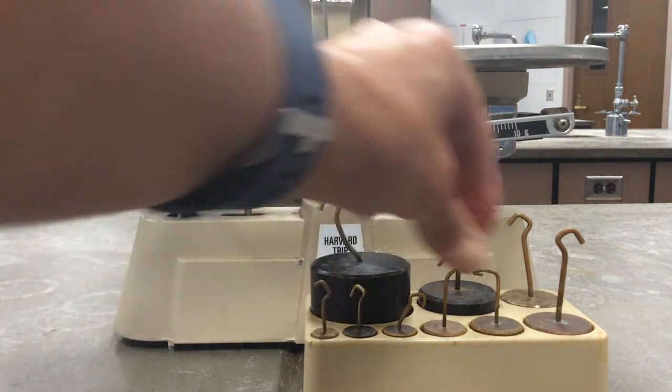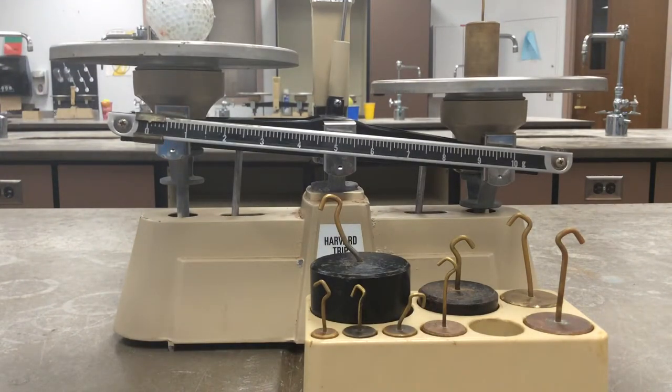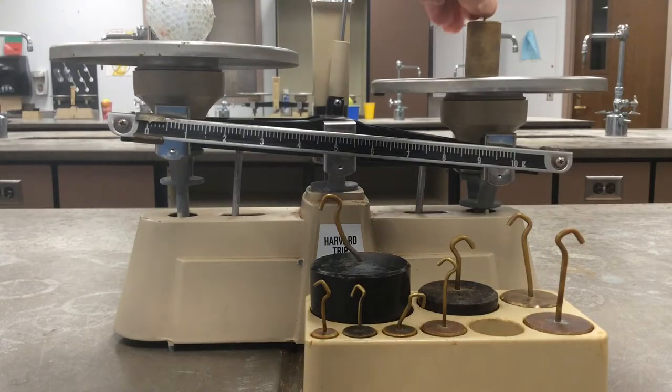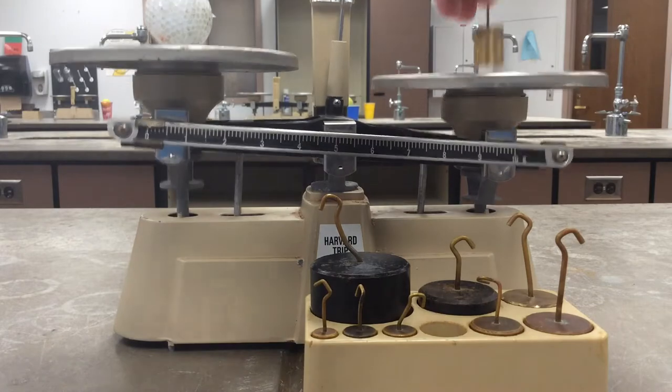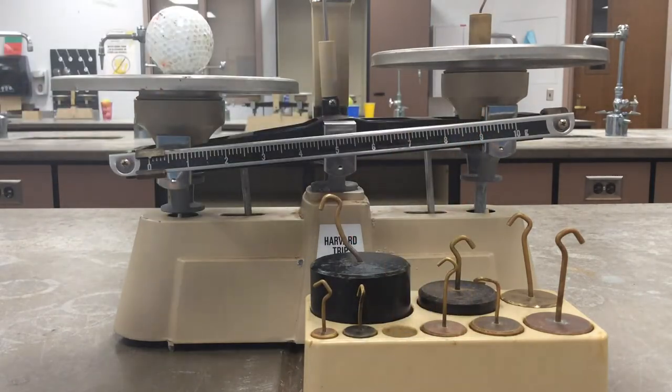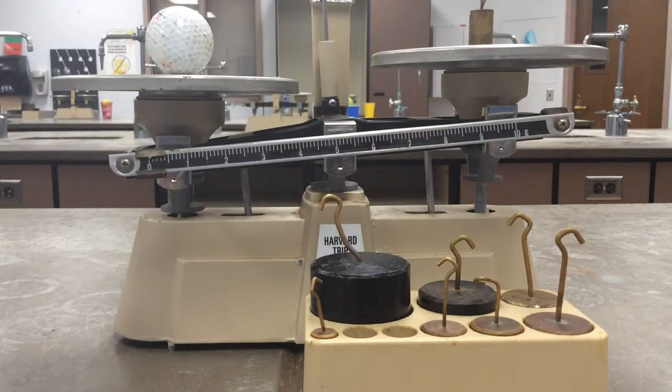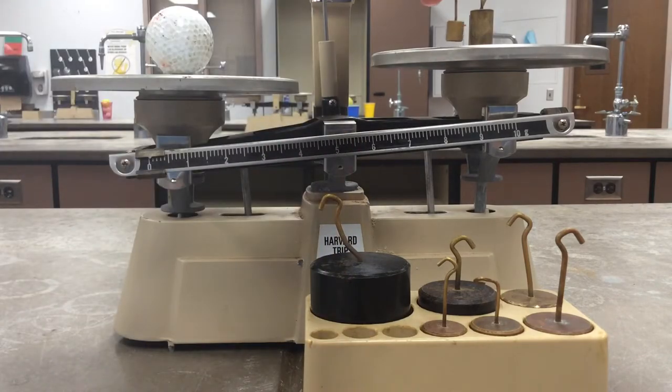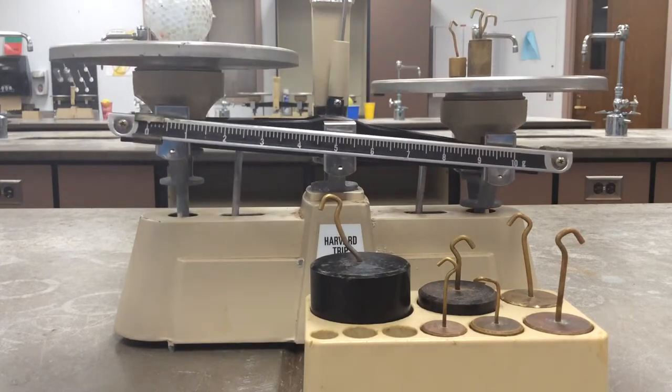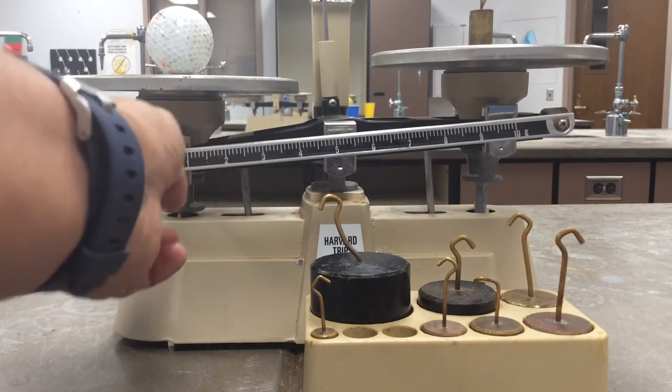So I'm going to start with 100 grams, and so that tells me that the 100 grams is way too much. Then go to the 50, again way too much. 20, not enough. I'm going to add another 20, starting to move a little. So let's see if the 10 is too much. So if that would be 20 plus 20, that would be 50, so it's less than 50 grams. So now I'm going to use the rider.